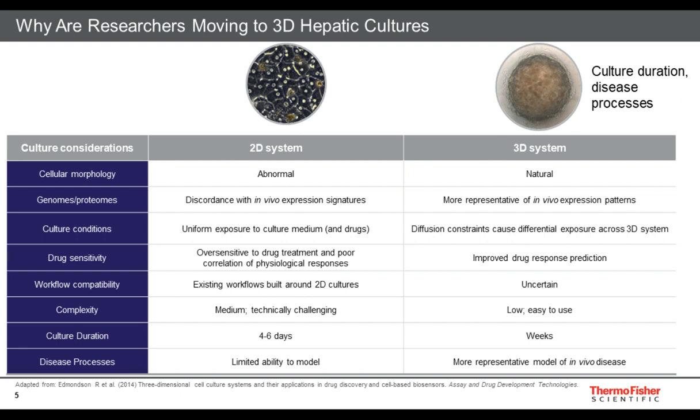In some ways, the complexity, once one has a lot of cells that have been screened or they're capable of forming spheroids, it's actually not that difficult to consistently create spheroids. The Sphera 96-well plates are the format that we've been using fairly extensively. It's actually fairly straightforward to do, unlike plating monolayer cultures of primary human hepatocytes, which can be challenging to do consistently.